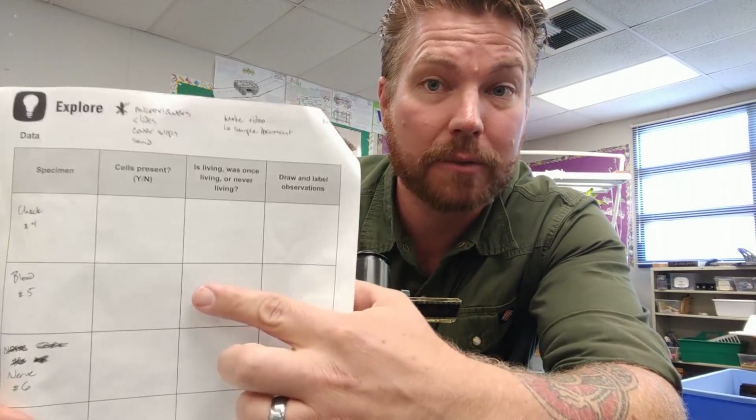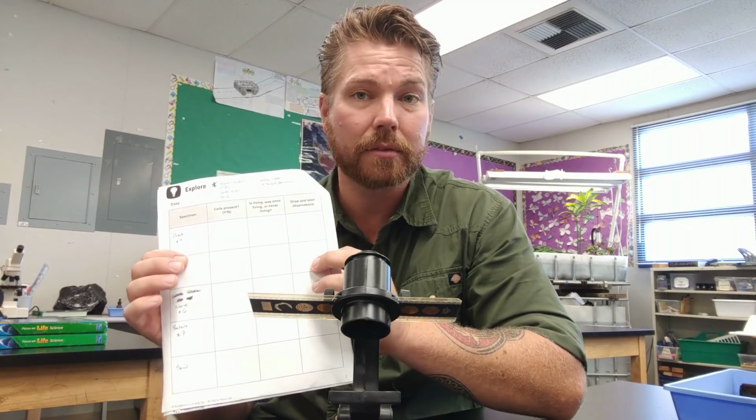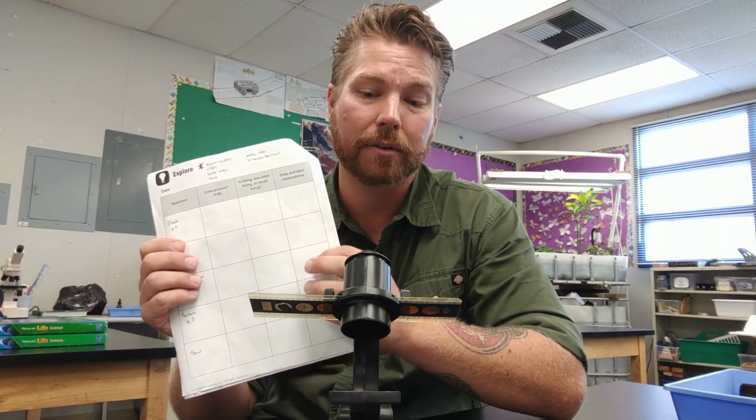For each one that you look at, tell me, are there cells present? Do you see any cells there? And then in the next column, was it living ever? Did it come from a living thing, or did it come from something that was never living at all? And then lastly, I want you to draw what you see and any observations that you have and any labels that you can add onto it.